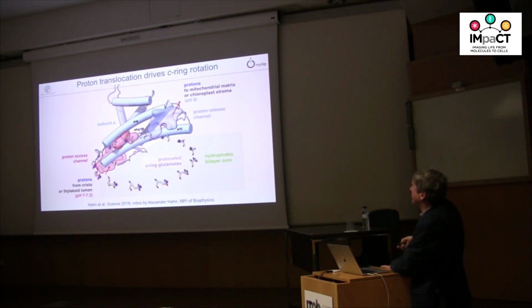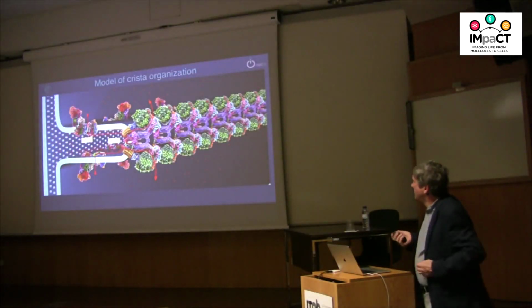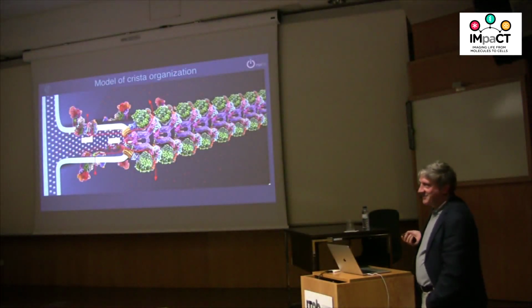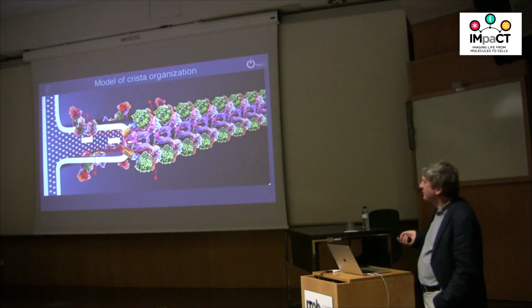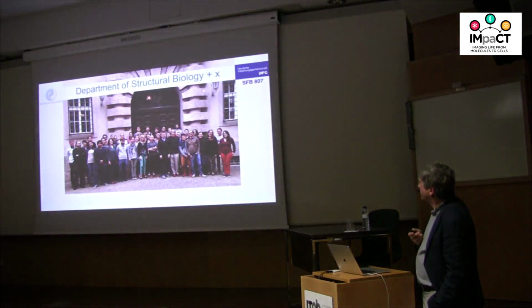rotation, right? So this is the last slide. It's just a recent model building, showing the rows of dimers and complex I here, pumping protons into this confined space of the cristae, and then the ATP synthase converting the local proton gradient into making ATP in the F1. Right.